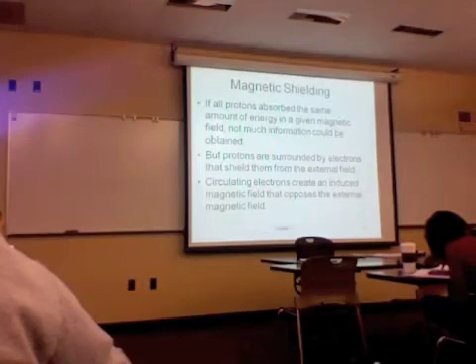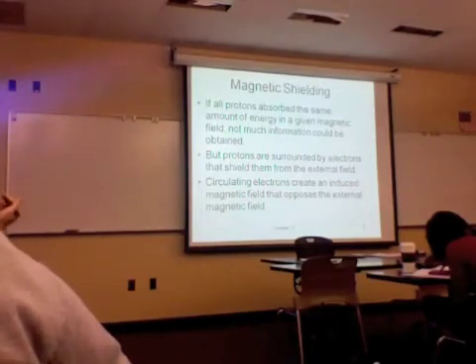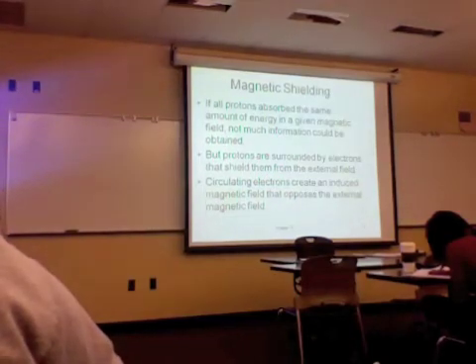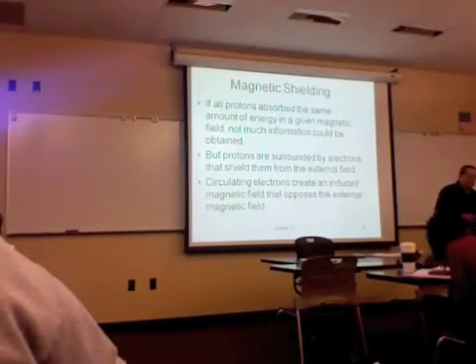It turns out that electrons oppose the applied magnetic field. And so if I'm a proton in an electron-rich environment, it's going to take more energy to get me excited. Does that make sense? And that's what creates the powerful aspect of this whole technique.